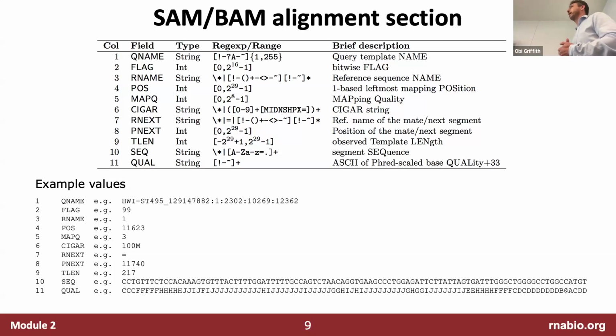Something like that, yes. Conceptually, yeah. I have to think about that, but I think that might be right, because it's the start of read 1 and the start of read 2, and the distance between them. But you could do that math and see if it's matching up, but it's something like that. Someone was asking if the T-len, the length, is just the position of the read versus the position of the mate subtracted, and I think it is.